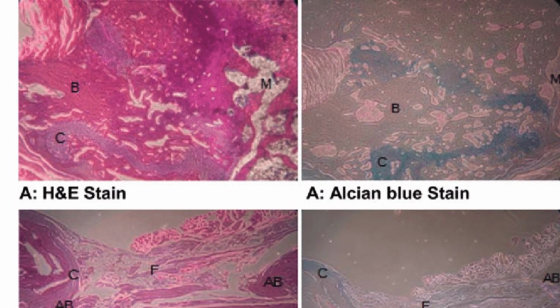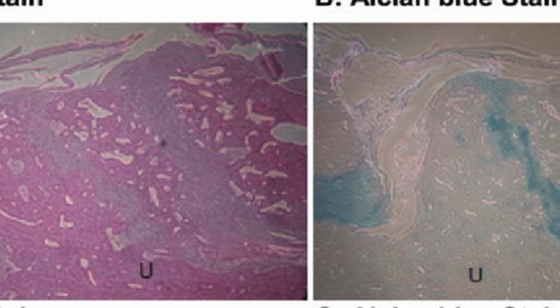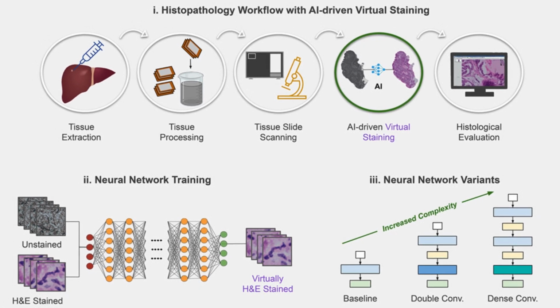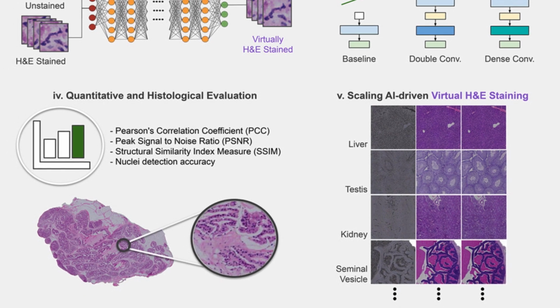Histological stains can be broadly classified based upon the kinds of tissues or structures they stain and their chemical composition. Some of the stains are more specific, hence targeting special cell types, organelles, or other extracellular components. Others are more general, staining all cells and tissues alike in the same way.